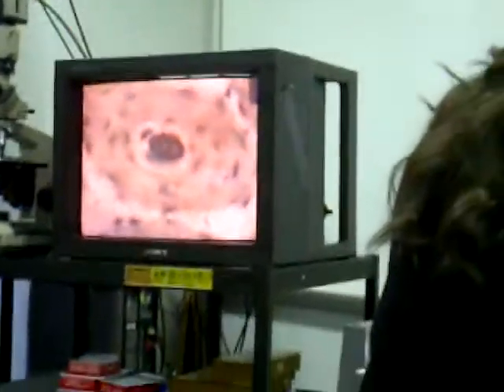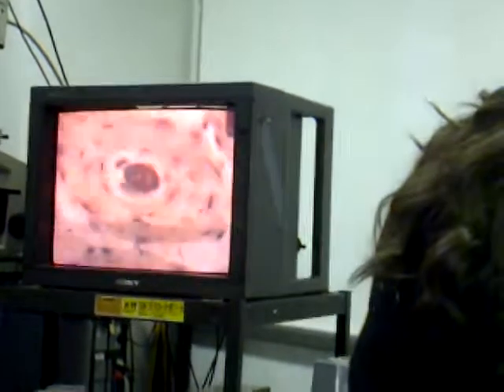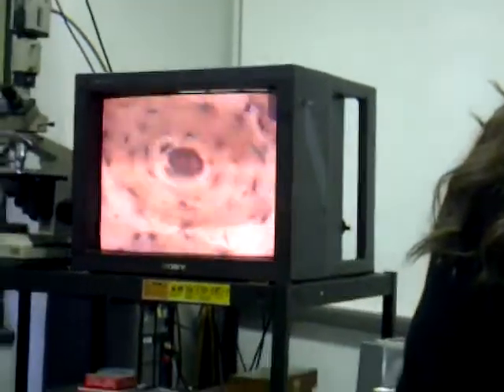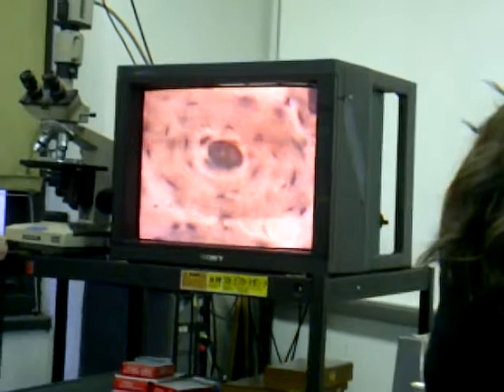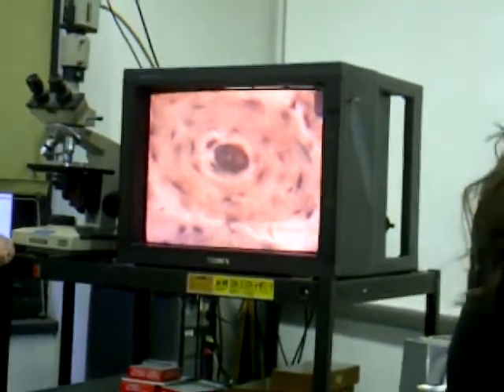So you can note that down. When you come up to the microscope, notice which objective's in place. That will help to orient you as to the magnitude of what you're looking for. So that's a typical question, and you shouldn't get this wrong. Everybody should know that's compact bone.